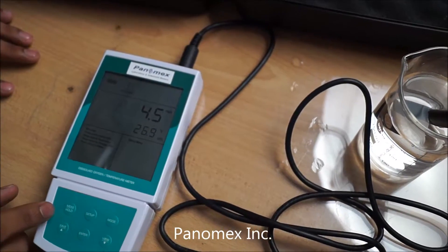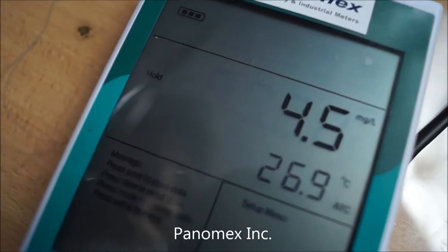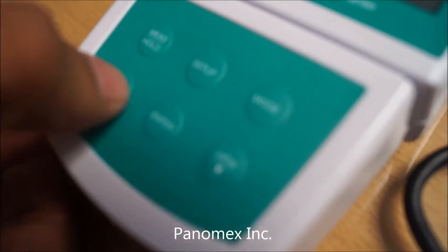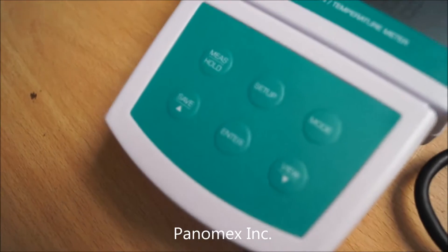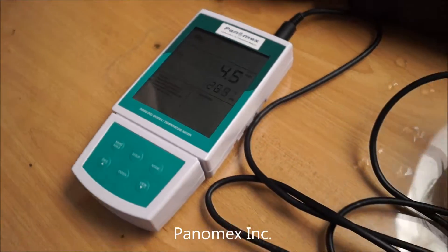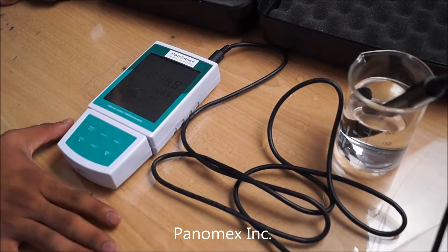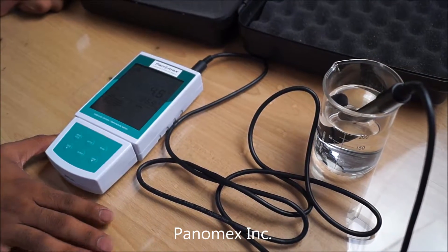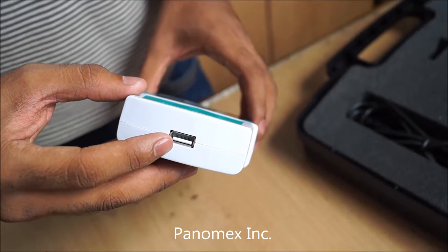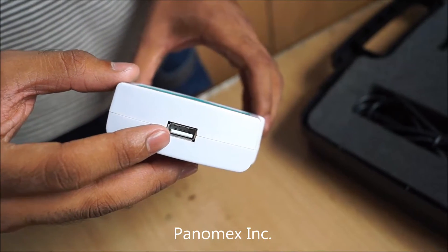You can press the button to hold the reading like this. You can also save it by pressing this button. Through the USB port, you can collect all the saved data and transfer it to your computer or laptop. Thank you.